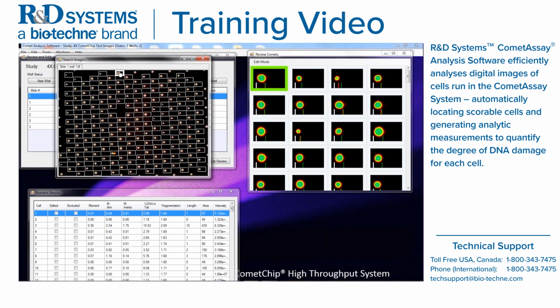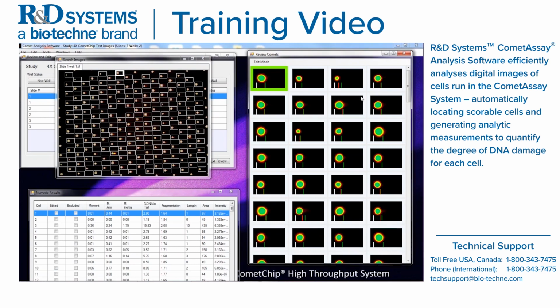But what you can do in these search images, suppose this one highlighted in white was actually not within the pore. You can right-click on it and it's going to exclude it. It'll exclude it here in the search image window. It'll show it excluded in the review window and also in your numeric results. And you can toggle back to unclick it. Like I mentioned, this is very nice because you can eliminate artifacts or hedgehogs within the search window. It's very fast.